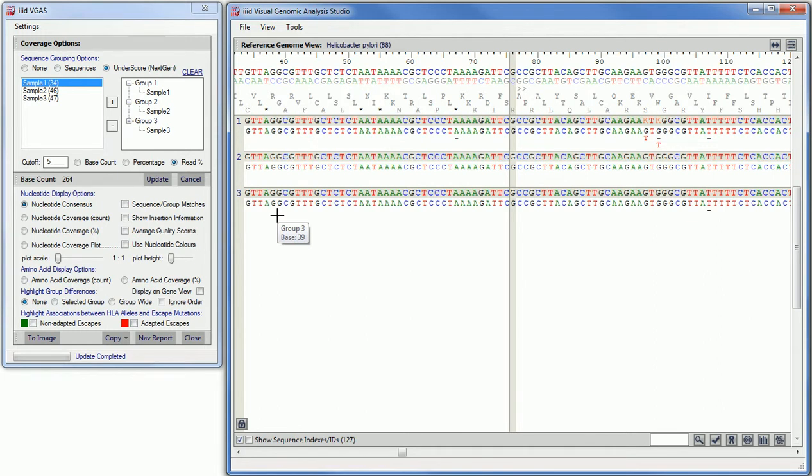The nucleotide consensus: the top row is the consensus made up of all possible bases found at that position. So we see either an A, C, G or T, or an ambiguous code where more than one base exists at that position. The next rows are ordered by base occurrence. Therefore, the second row is the majority consensus.